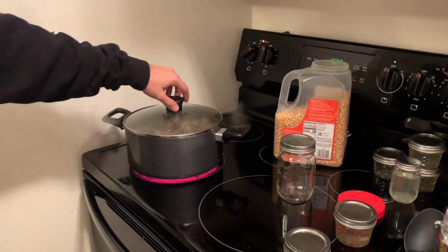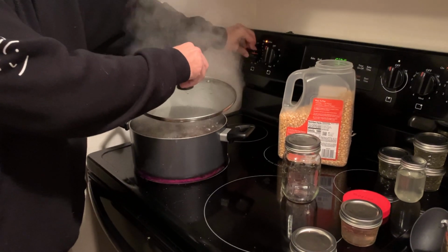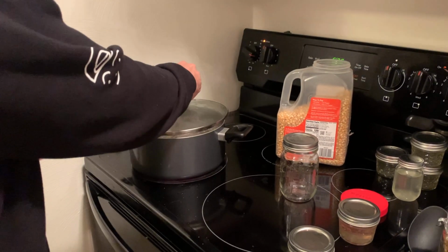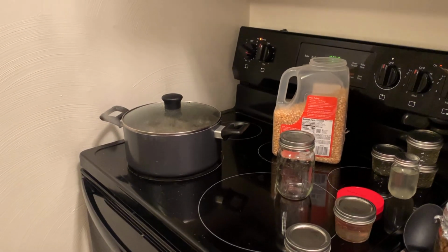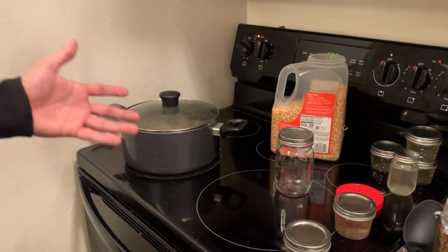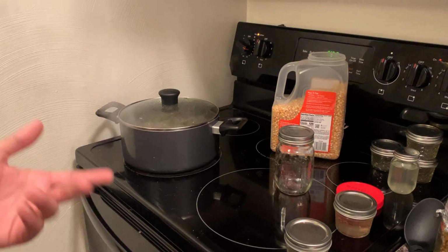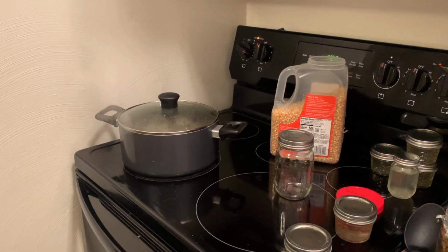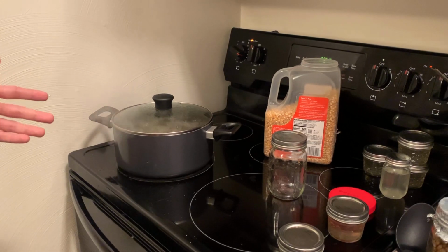Okay, so now that this water is boiling, we're gonna go ahead and turn down the heat a little bit. Just keep it on a nice simmer. Remember to add enough water. I always boil it for the 45 minutes and then I come over and check it and it's almost out of water. I almost burn my popcorn almost every time. So make sure you put enough water in there and then just leave it there simmering for 45 minutes.